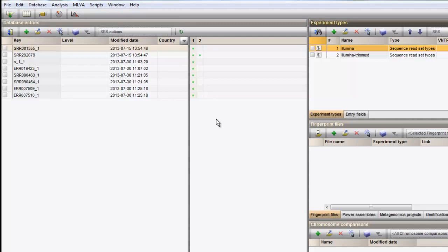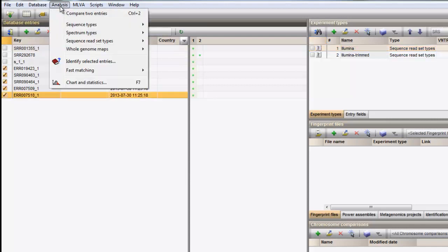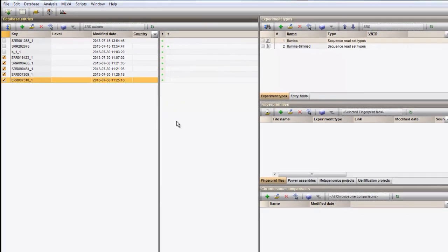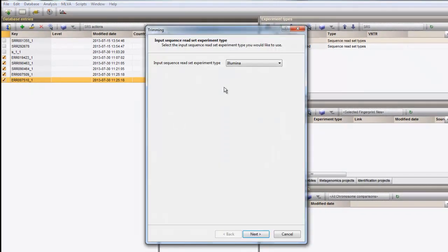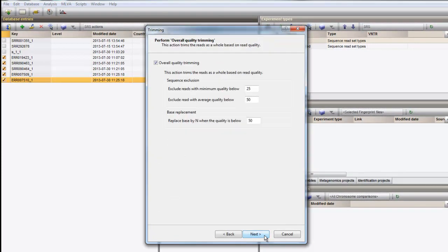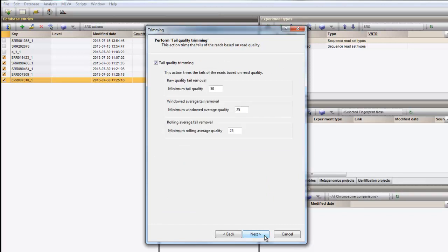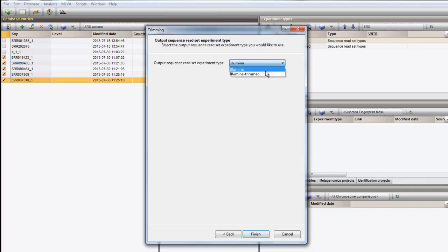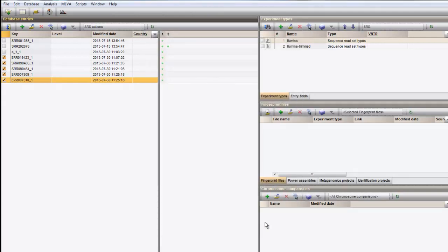If you want to run the same trimming pipeline on a number of samples, you can simply select all these entries in the database and start the trimming in batch. This will automatically generate a trimming project for each sample and execute them in batch.